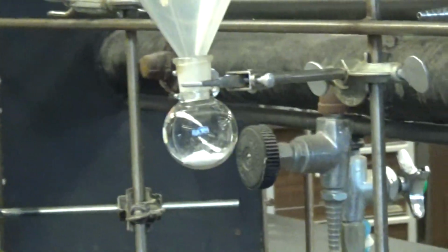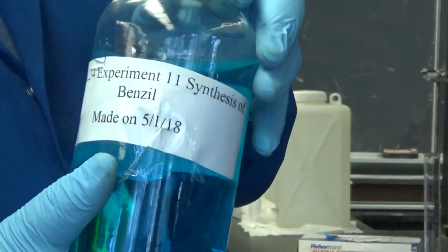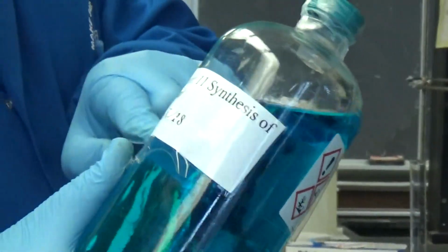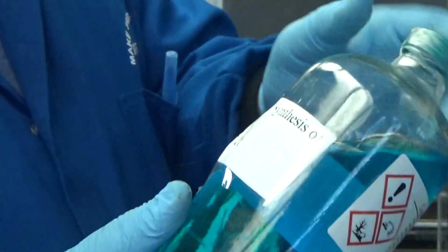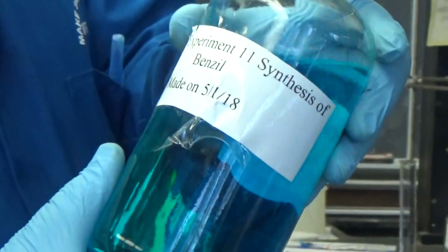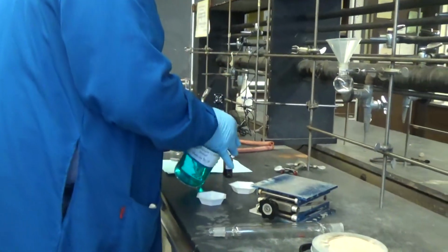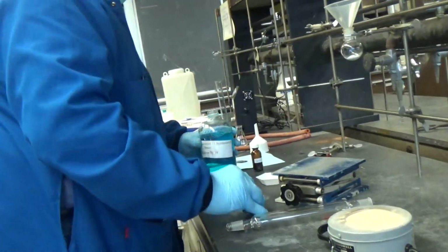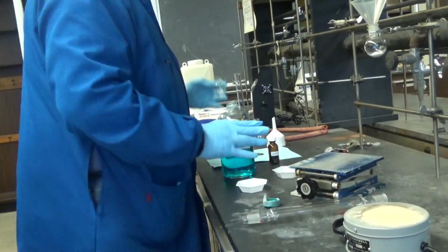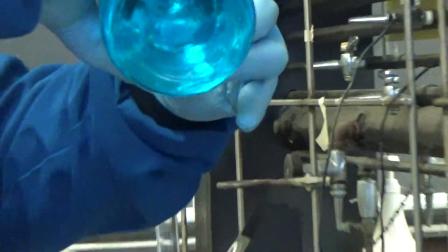Now you need 20 milliliters of copper acetate. Use a beaker.